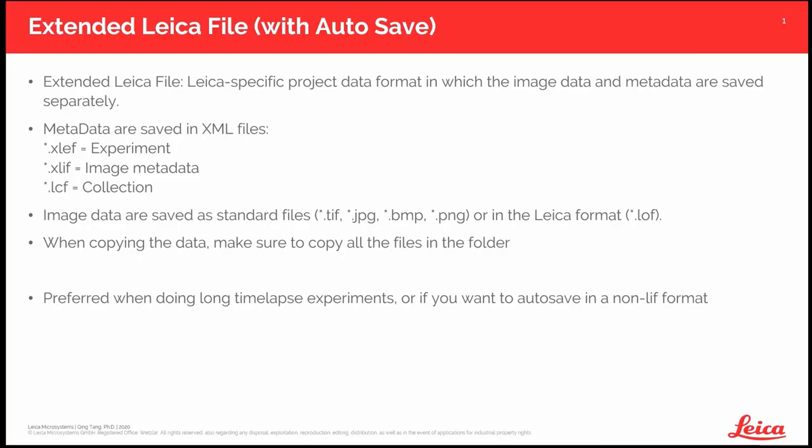I will talk about extended Leica file first. This file format will be used when you enable autosave. In this format, the image data and metadata are saved separately, and the images will be saved right after you capture each image.